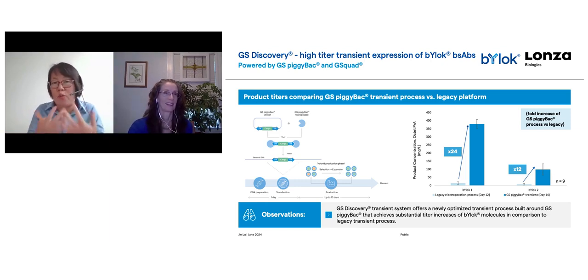You will have to screen which mutation combination would work best. So you will have to do a pre-screening work and pick which is going to work for your molecule.